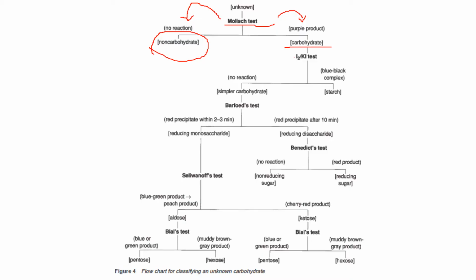Now, the iodine test is a specific test that will help us figure out what type of carbohydrate we have. Is it a simple carbohydrate or a complex carbohydrate? Since our four choices of carbohydrates are lactose, glucose, fructose, and sucrose, it is expected that they will not give any reaction or color change, and no formation of a blue-black complex will be observed if any of these four sugar solutions is present in our unknown.